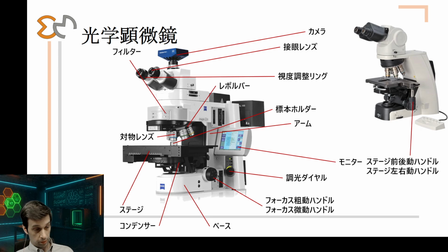And then there is the condenser that is basically to focus the light on the sample. And of course, we have the source of light. In this case, it's in the back. And again, in the past, it used to be a candle or even the light of the sun, which was directed then to the microscope. Nowadays, we have fluorescent lamps, filament lamps, and LED. Nowadays, probably LED is becoming the most common light source for microscopy. It didn't used to be.